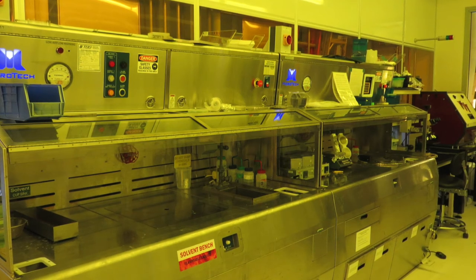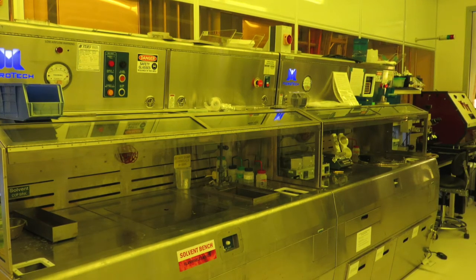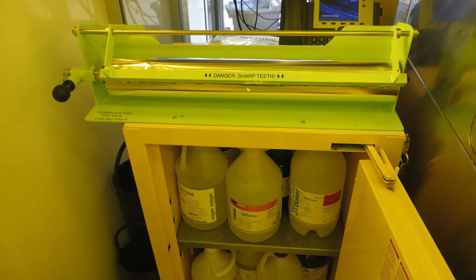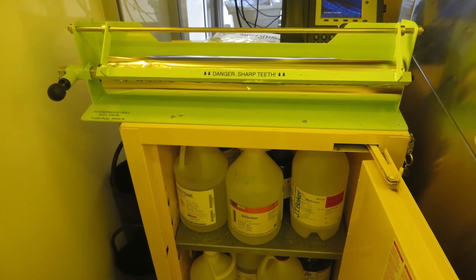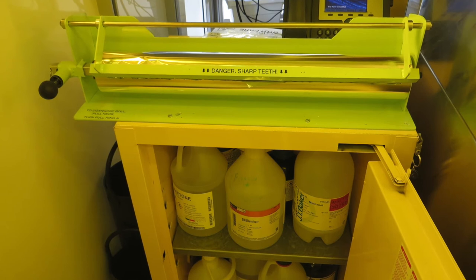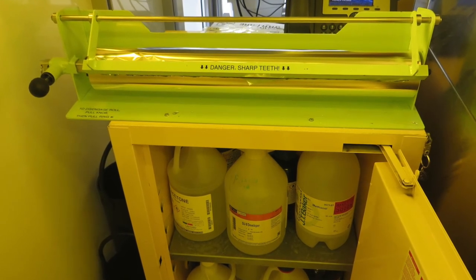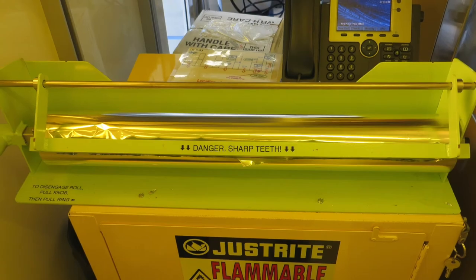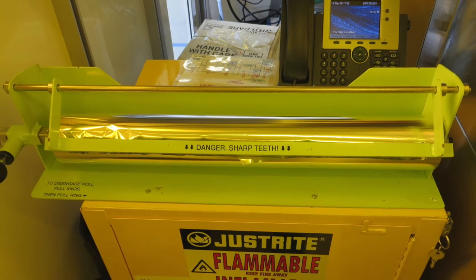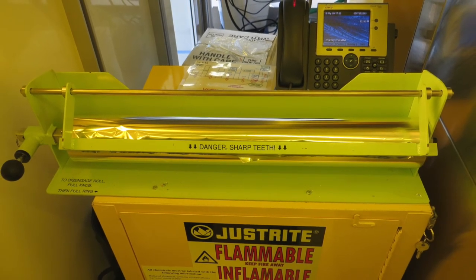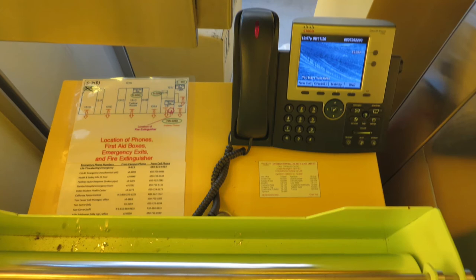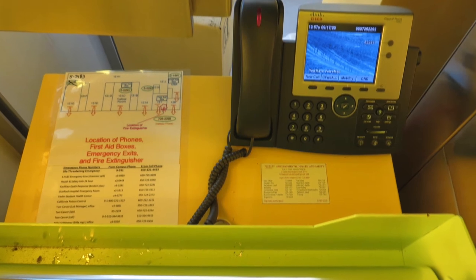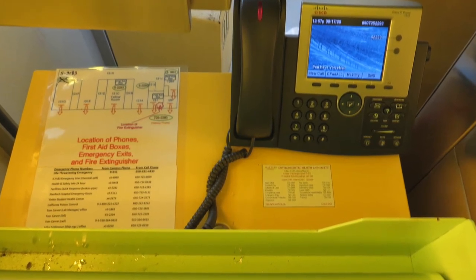If you use up the solvent in one of the squeeze bottles you can find gallon bottles in the small yellow cabinet to the left where you can refill the squeeze bottle. If you can't find the solvent you need, there are more bottles in the tall cabinet in the service chase behind the solvent bench. That service chase is dirty so it'd be better if you asked the lab supervisor to put one of the bottles that you need in the pass-through. On top of that small cabinet is a roll of heavy duty aluminum foil which is mainly used to line the spinner with to make cleanup easier. Behind that roll of foil is one of the three phones within the cleanroom along with a laminated card with emergency contact information. Every phone in the lab has one of these laminated cards next to it.